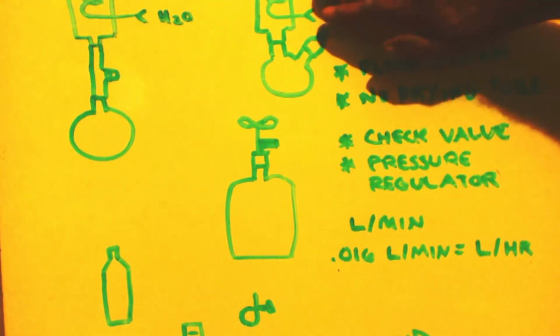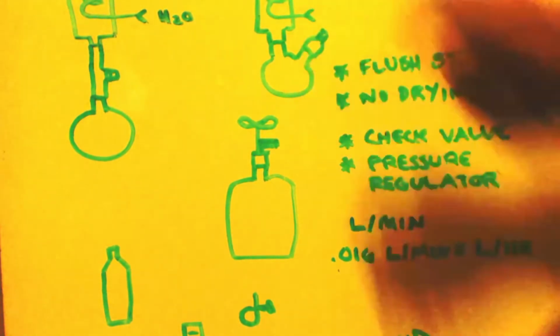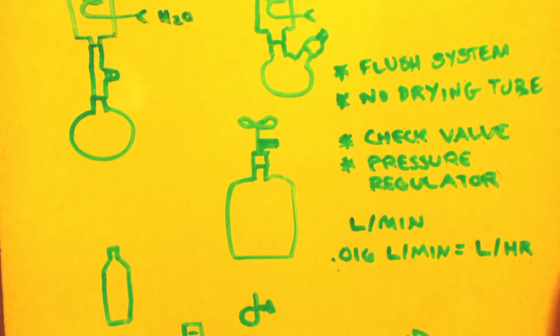Of course, so you're going to have to extend your condenser more, right? You want a longer condenser so it has more chance to condense the stuff out and not take your chemicals away, right? You don't need a drying tube, because that will just impede stuff. The drying tube is so that no water can get into your apparatus. Well, you don't have any water. All you have is argon. So you don't have to have a drying tube.